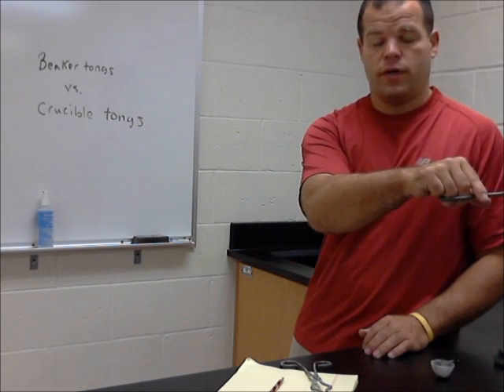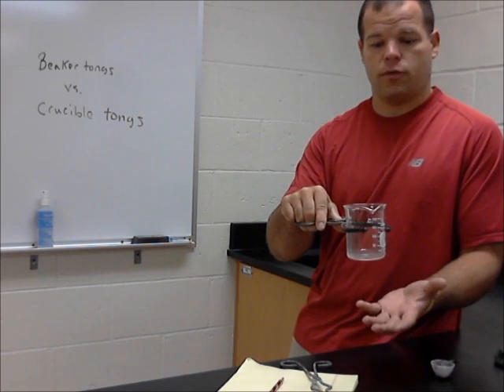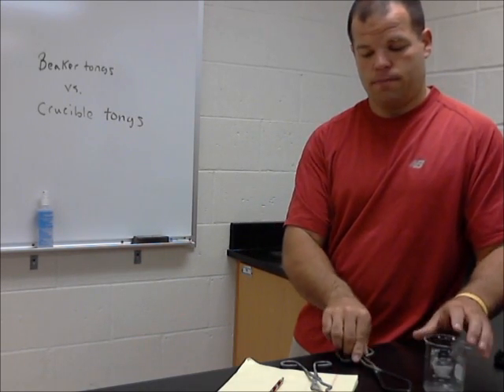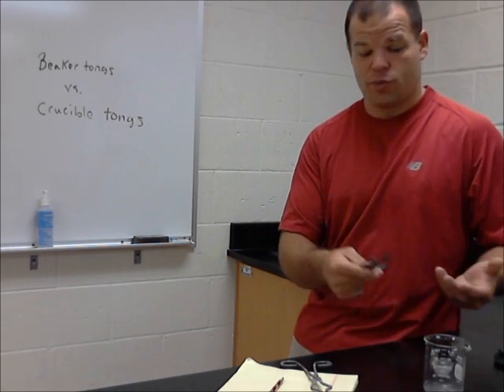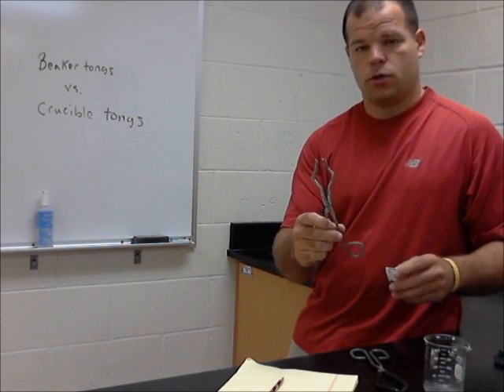You could pick it up off of a Bunsen burner. It could even be quite warm. Be careful when you're moving it. Obviously, anything we want to be careful with, but in this sense, it moves very well. Beaker tongs, beaker. It might seem strange that we need to talk about beaker tongs working with a beaker. The reason why is we have another type of tongs called a crucible tongs.